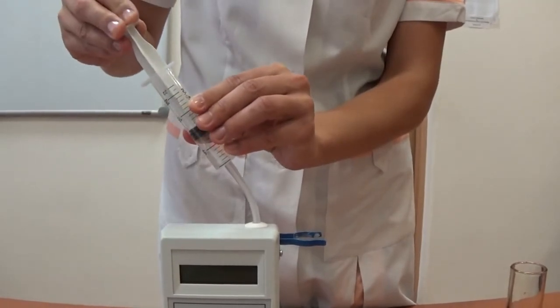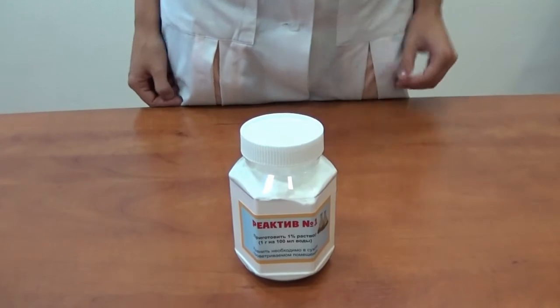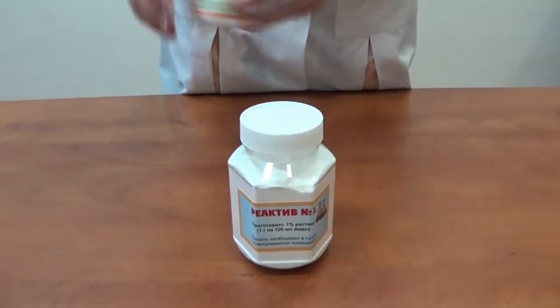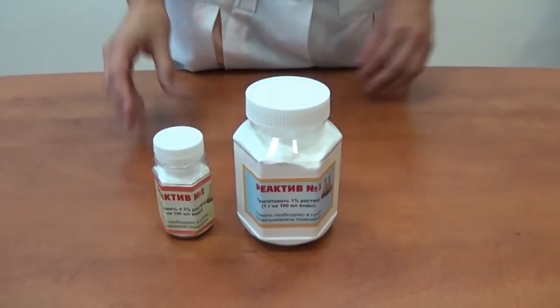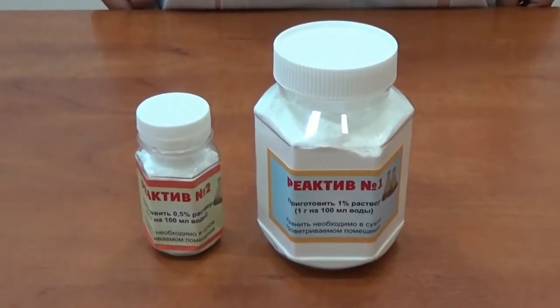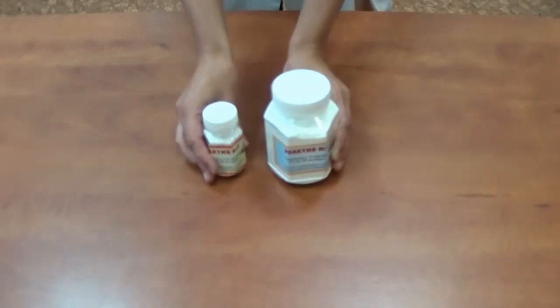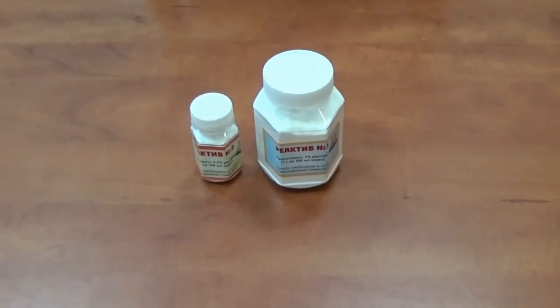Clean the measuring channel of the analyzer with distilled water, then blow through the channel with an empty syringe. Once a week, after cleaning with cleaning reagent number one, we recommend carrying out a more thorough cleaning using cleaning reagent number two. The cleaning procedure with the solution of cleaning reagent number two weekly is absolutely the same.